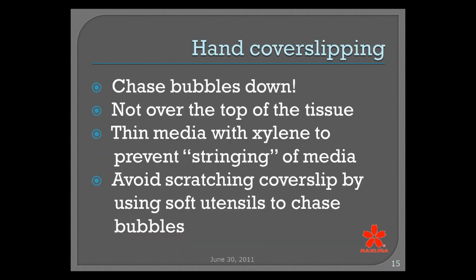Hand cover slipping. Okay, so not many of us still do hand cover slipping out there. I'm sure most of us have either the tape or glass cover slippers by now. But sometimes there are situations where you do need to hand cover slip. Frozen sections might be an example of that.